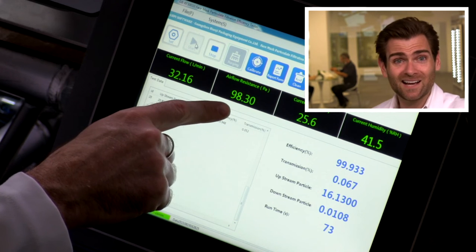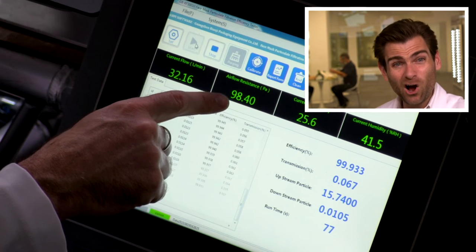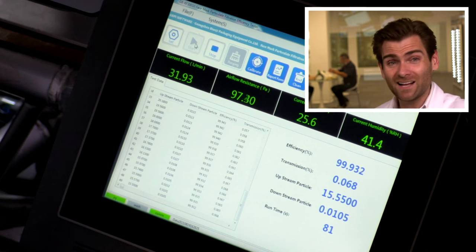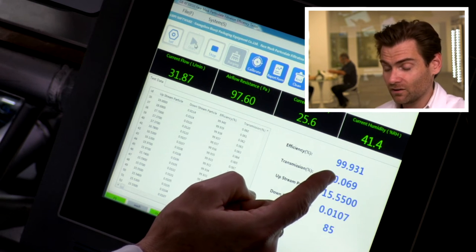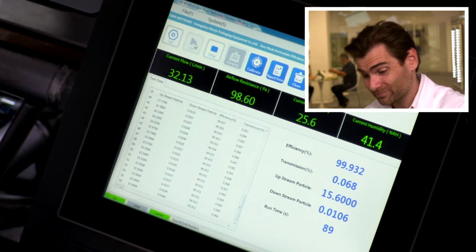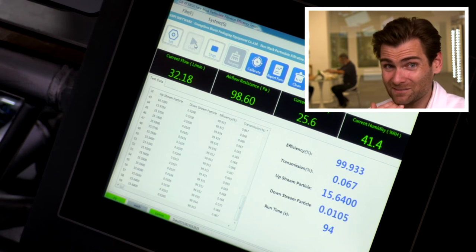First thing I'm going to notice is, dang, look at that airflow. That's awesome. The airflow resistance — 100 pascals. Beautiful. That's a breathable mask. That's like one of the most breathable masks that we've had in this machine. And look at that efficiency — 99.93. That's really good. I saw some things on there that said that this wasn't maybe real, but I'll tell you what, if it's not real, it's a good fake.